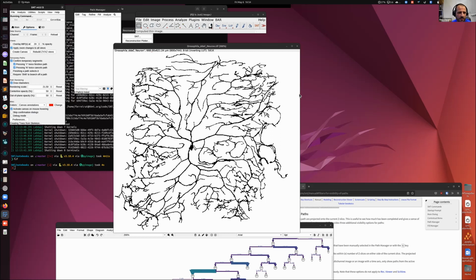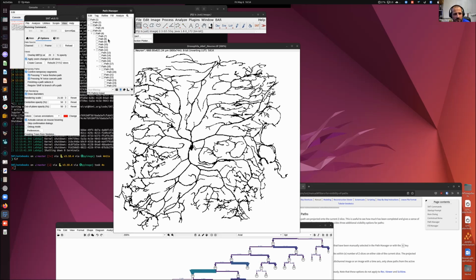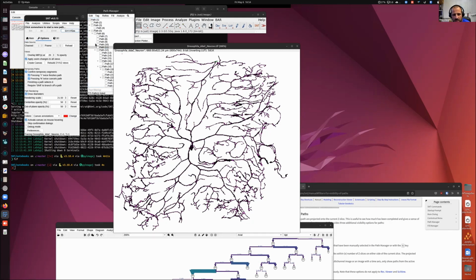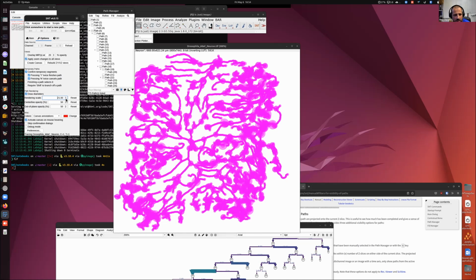And you can see there's a debug mode option. If I toggle it on, you would see in the console what it's doing in the background. And so now your reconstructions are here. Because we have a filtering operation, you have now in magenta. So I'm just going to change the colors and the sizes so that you can see better. I think my computer's getting a bit slow because I'm running something in the background.